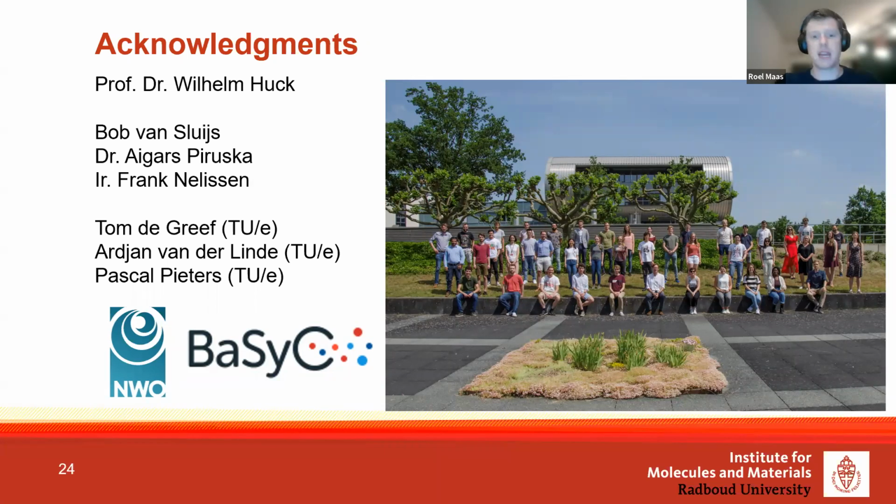Yeah, in principle, you could do everything. At the moment, in the group, we're looking at the use of toehold switches, for example, to repress at the mRNA level. So they'll again get more information out of the system. But in principle, almost all repressors have a specific ligand. So you can also add this ligand to again remove the repression. This also gives you more information. So again, the more experiments, the better, basically, for the whole system. But I think you can use everything to start repressing.